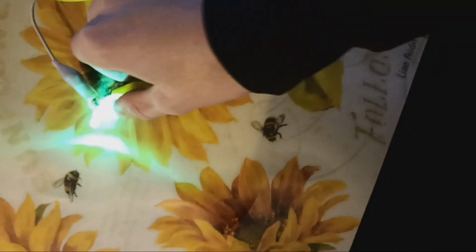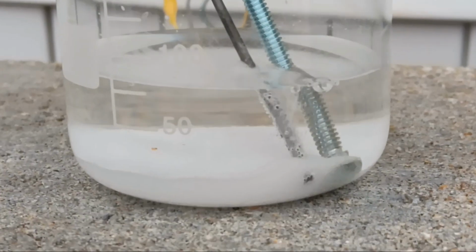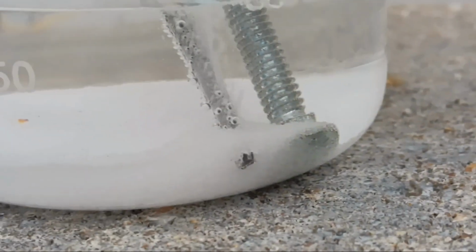This time I actually knew where the anode and cathode were, and used the patented LED test to find it. At long last, it was time to do some electrochemistry. We're going to run 5 volts through this solution. This is not a lot, however, this is what I can do safely with my current technology.